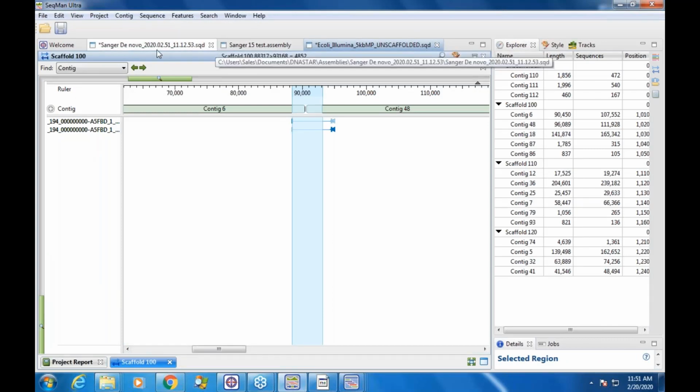That is what will change with the next update, is that those multi-sample aligned to a reference in the next update will align and open in one view so that we can easily cross-compare across. It's actually functionality similar to what we had in version 12.2 way back then, where we had kind of multi-sample viewing in the alignment view. So that will come back, but it's the next update that brings it back to where it really becomes a powerful analysis tool.